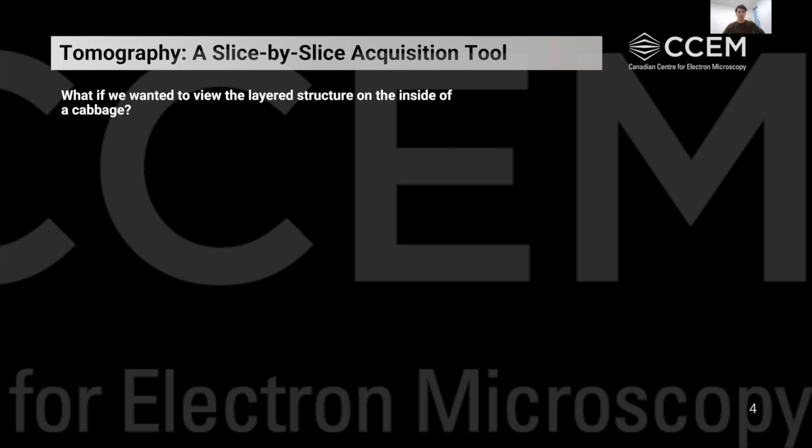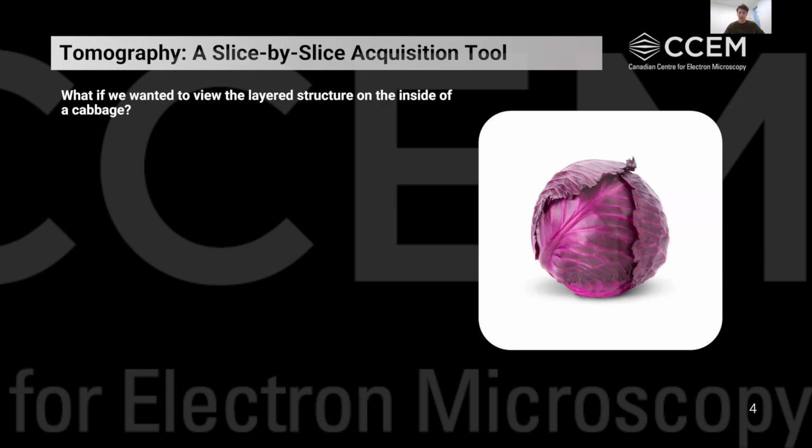With this question of what if we have this structure that has a complex morphology on its inside. So something like cabbage, for instance. On the inside of this cabbage, it has a number of layers and a very unique sort of macro structure. And so if we wanted to view the inside layers of this cabbage, we could use a knife to cut away a thin slice of cabbage.